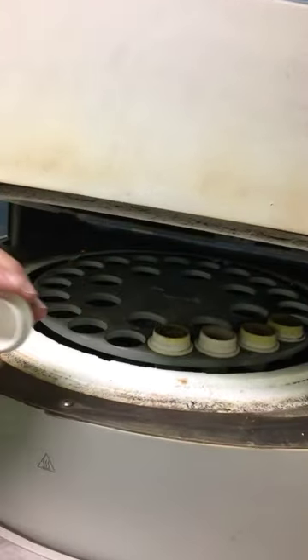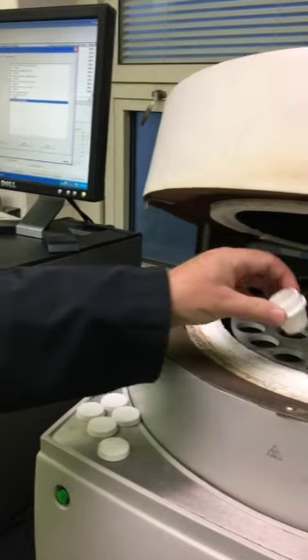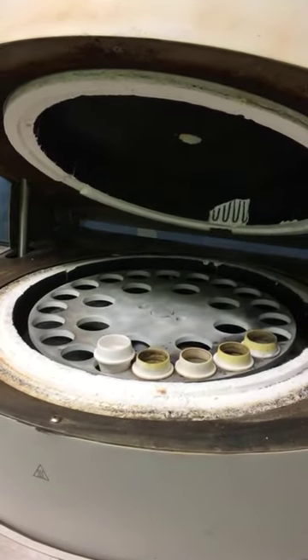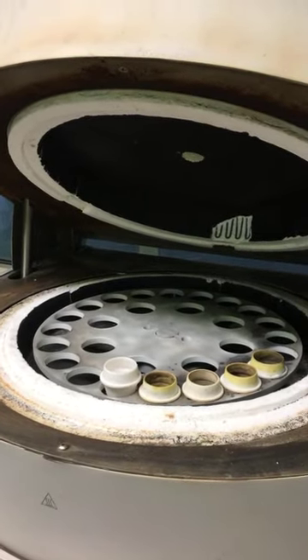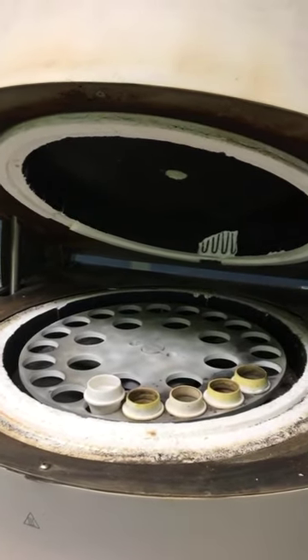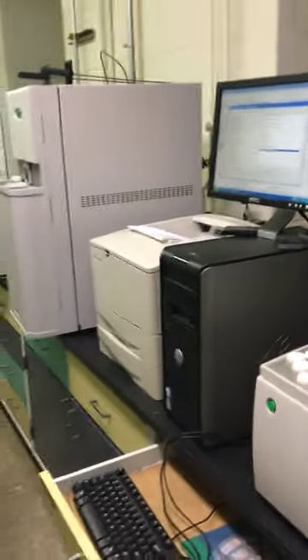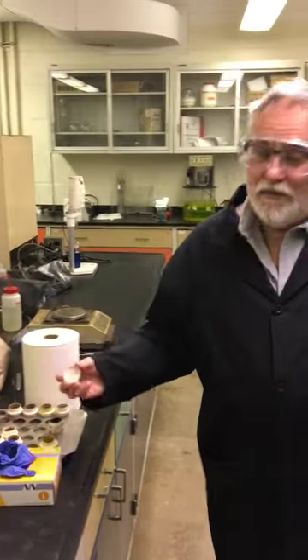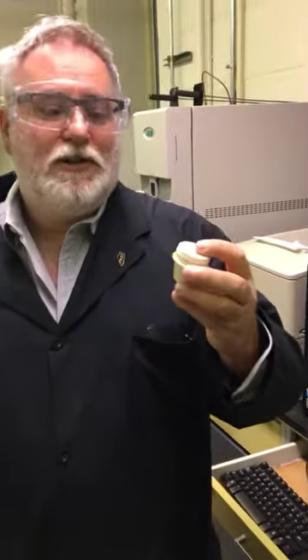This particular crucible is nice and clean. It is a reference crucible. We don't put sample in there, but you can see that we have multiple locations, so we can have 20 or so samples for the proximate analysis. The sample sits in a crucible, and that's the correct terminology to use. They also have a close-fitting cover. Again, that is the correct terminology to use.